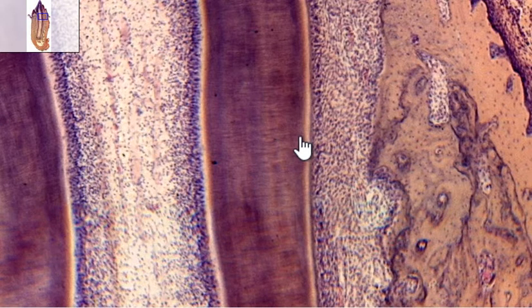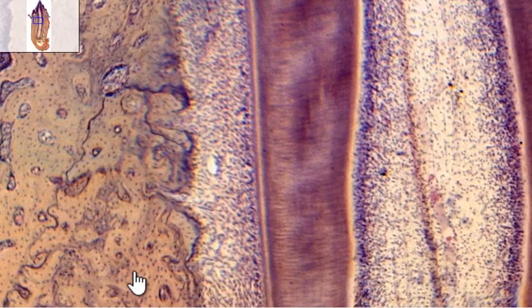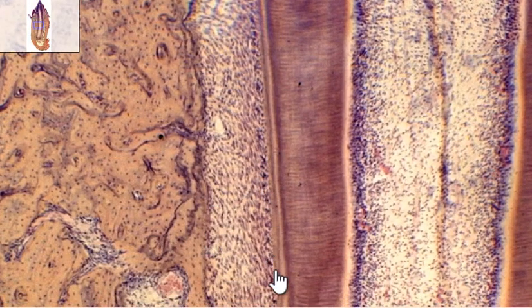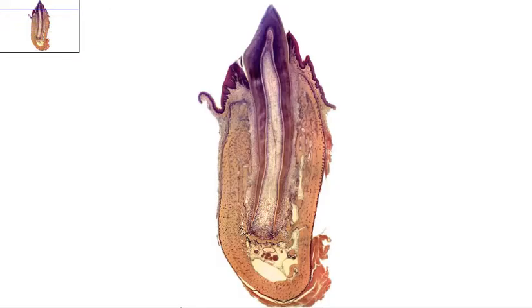They run from the tooth to the bone, and all this is going to be the actual bone where the tooth is anchored into. So you have the tooth on both sides anchored into this structure of the bone from ligaments, which are your periodontal ligaments, and cementum helping to hold it in place, all the way down to the very tip. You can see how the bone is encasing the entire tooth cavity here. So this is a slide of a tooth encased in bone.